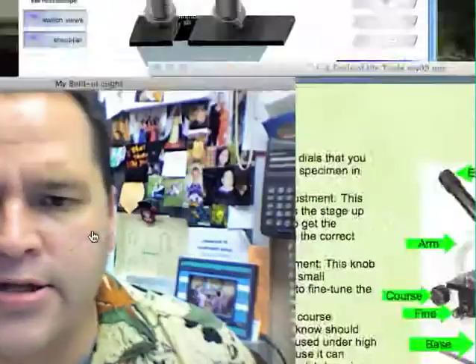So never, ever, ever touch the coarse adjustment knob under high power. Don't even think about it. And never remove a slide under high power, because if you try to lift it up, it's going to break, right? So what's the rule of thumb? Always go back to scanning power. You're going to start at scanning power. You're going to end at scanning power. All right? Let's go back.